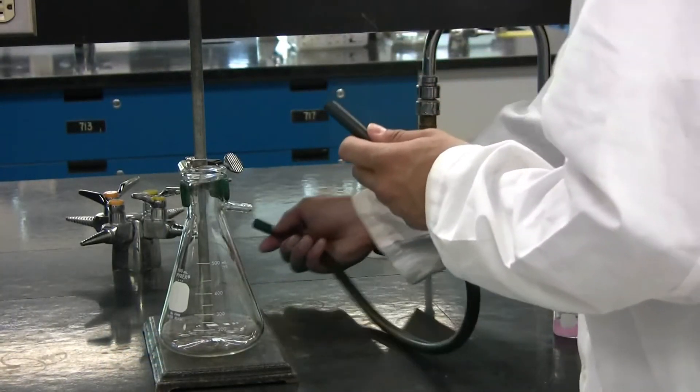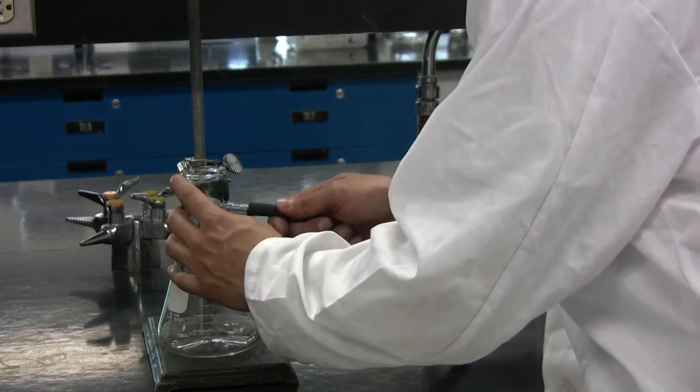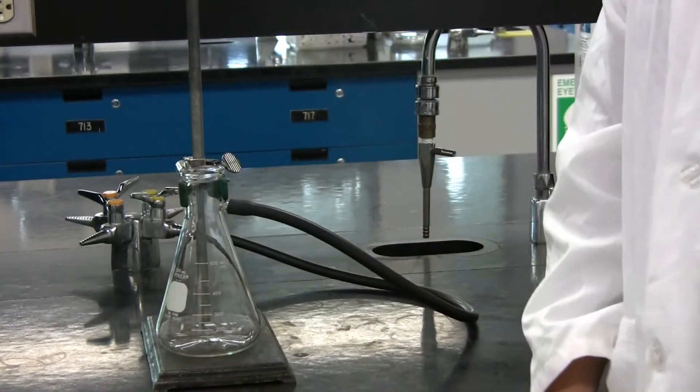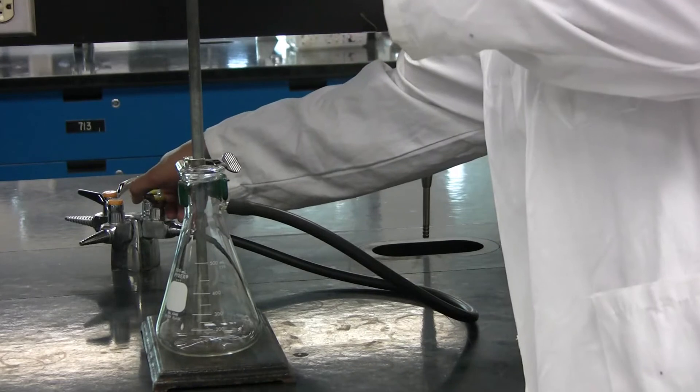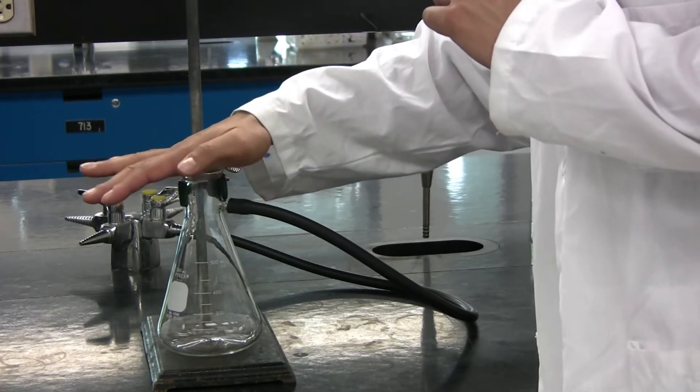Next, connect the vacuum hose to the vacuum and to the vacuum Erlenmeyer flask. Now, turn on the vacuum valve and test it with your hand. You should feel suction.